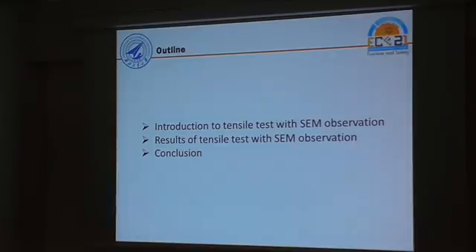First we will introduce the tensile test with SEM observation, and then we give the results of the tensile test, and at the last we give a summary and a conclusion for our research.